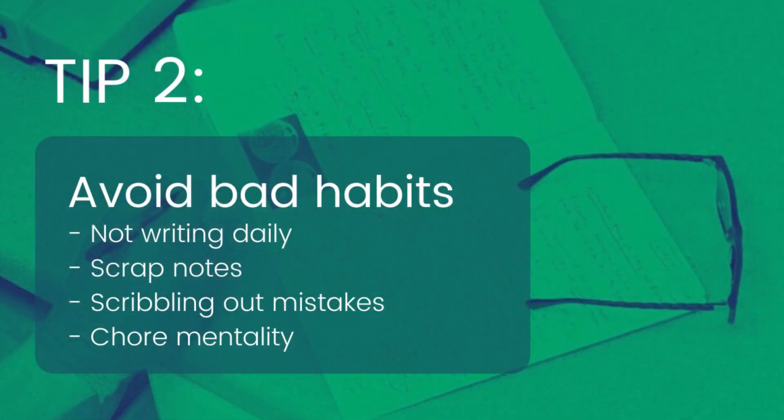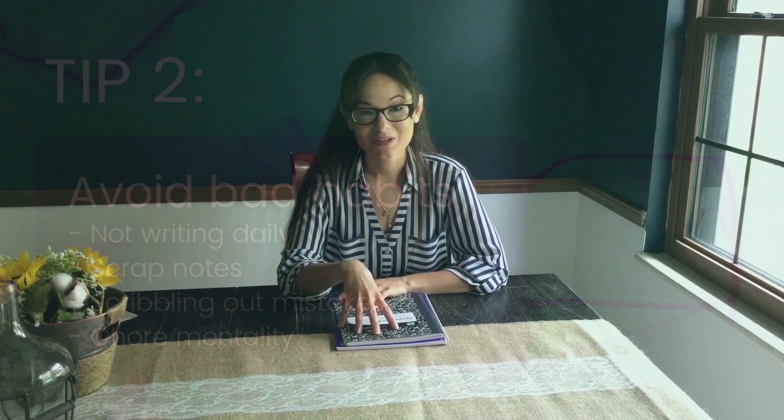The second tip is avoid bad habits. The first bad habit is not writing regularly in your lab notebook. I know it's really tough because the lab notebook has to be structured, you need to write neatly, and then you have everything else going on in the lab. But if you don't write regularly, you're going to end up getting backlogged and a lot of the information you need to put in there won't be as detailed because you're spending too much time trying to recall all of it.